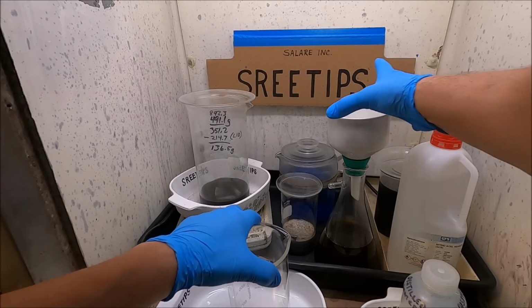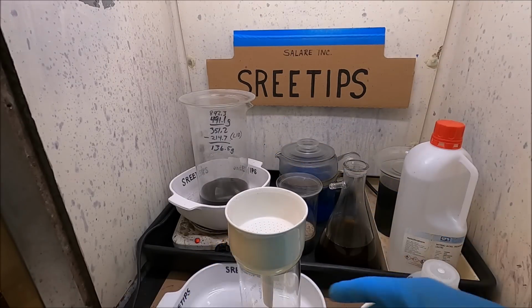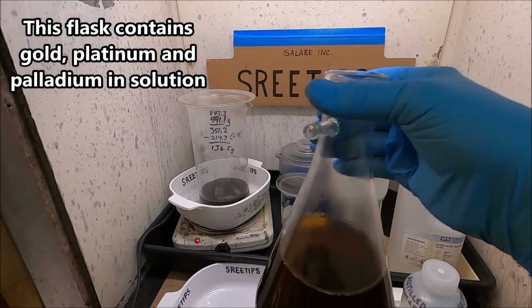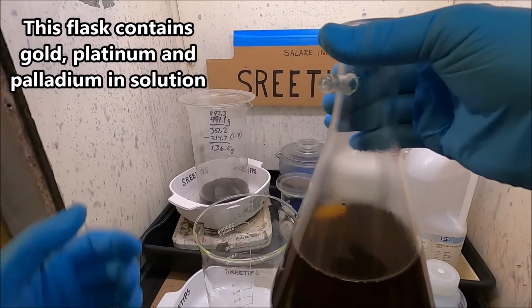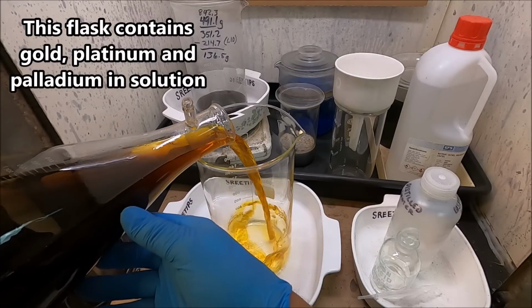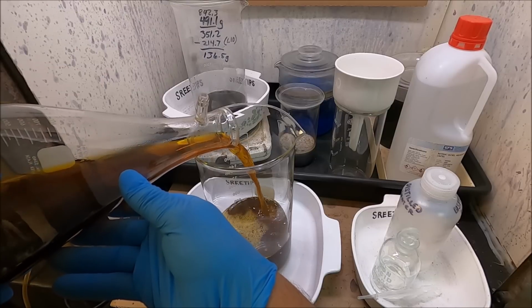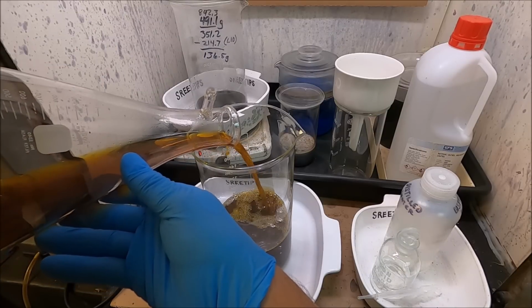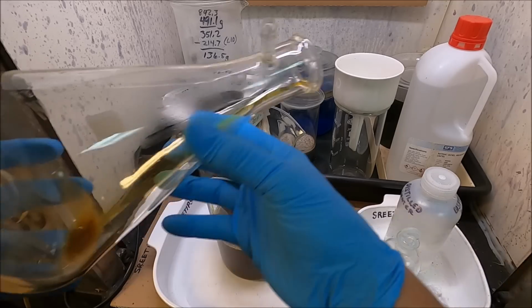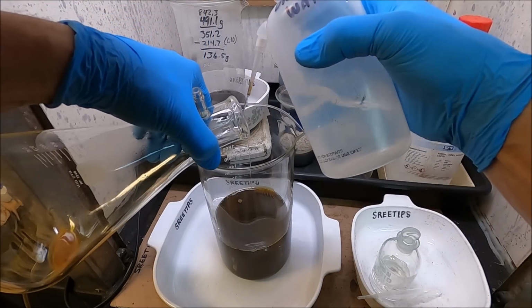Okay, let's pull this solution down out of this flask that we just filtered out. I'm going to pull it down and transfer it to this 2-liter beaker. Just filtered this out real good, so it should be a nice clear solution. It does have a little bit of sediment. I'm going to reserve that and not add it here.